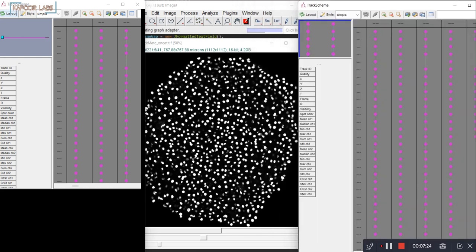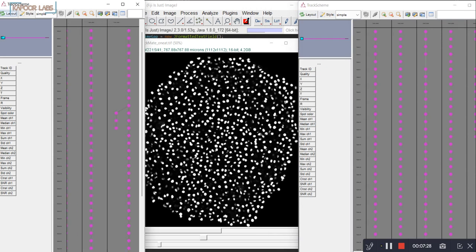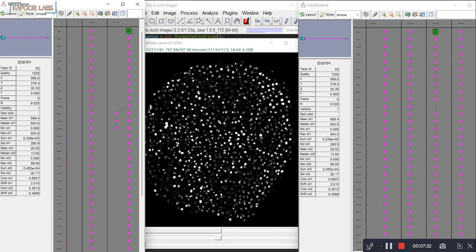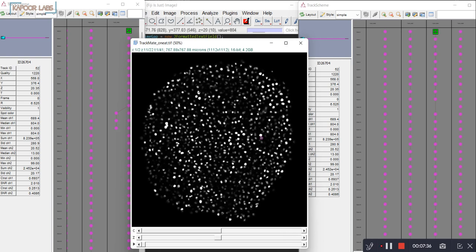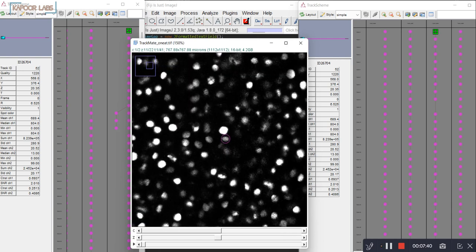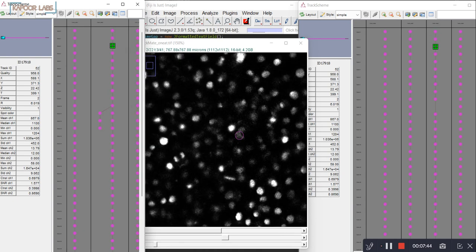And then we can see, okay, let's go and see where TrackMate thought there was a division. And here Oneat actually broke this link because it wasn't in the detection file. So let's see if it was correct to break this link.